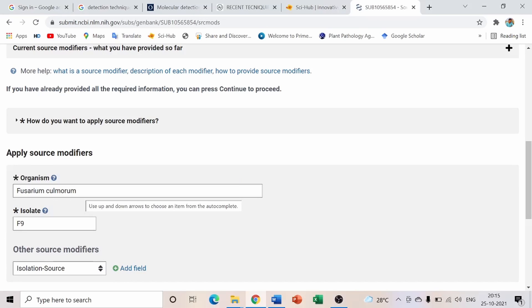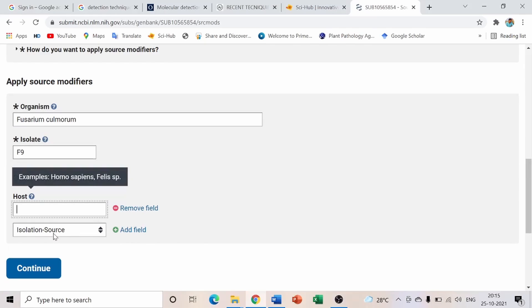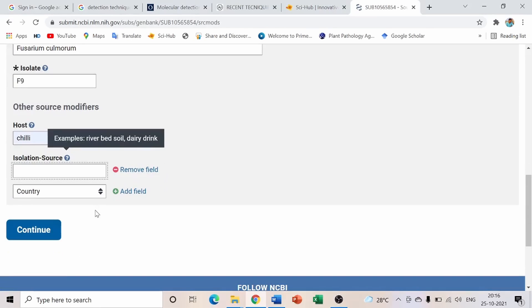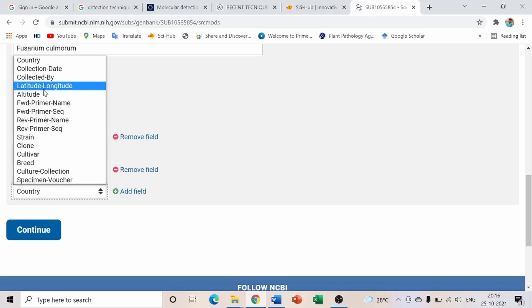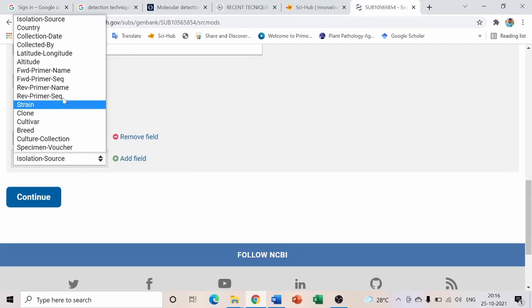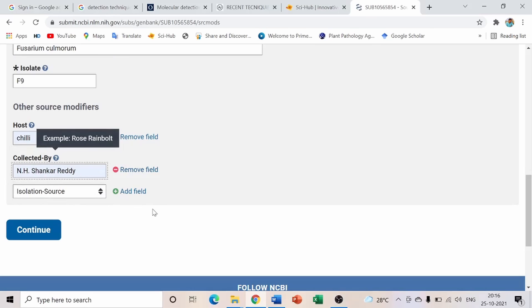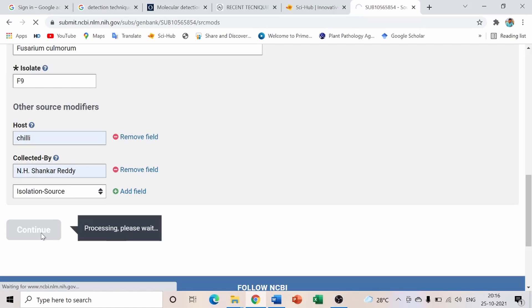Make sure the organism name you enter matches your sequencing data — this is very important because it will appear in your published data. For isolation source, add the host field. Since I collected from chili, I enter 'chili' as the host. You can also add fields like country and collected by.